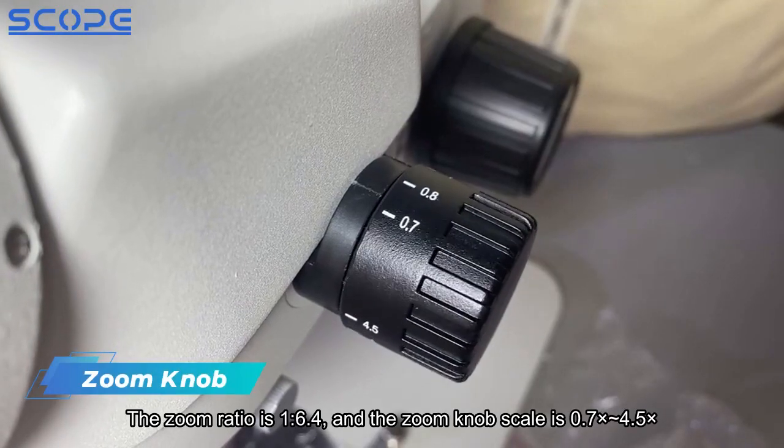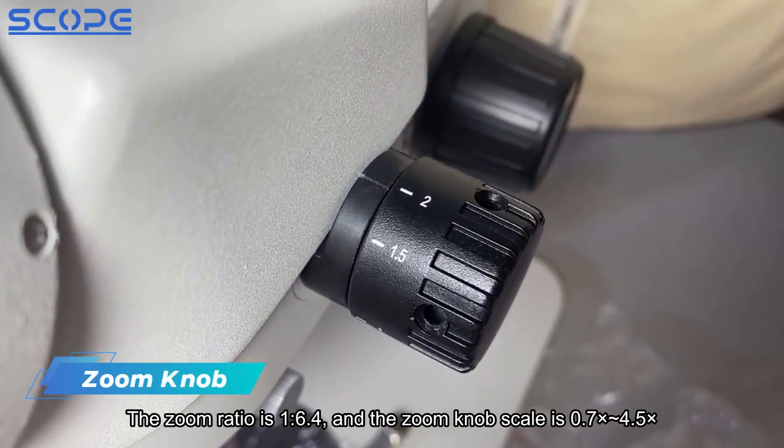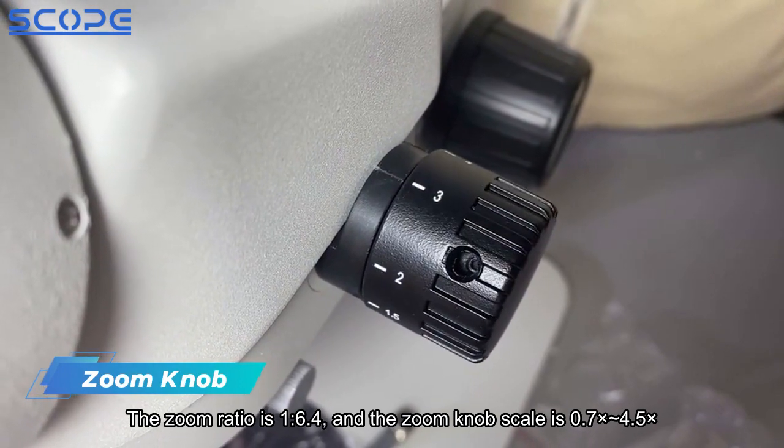The zoom ratio is 1:6.4, and the zoom knob scale ranges from 0.7x to 4.5x.